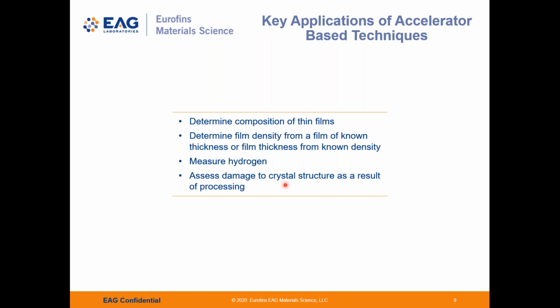Finally, being an ion beam technique, RBS can be used to evaluate crystalline damage in thin films as a result of processing, as well as provide information on dopants, impurities, and defect densities. Analytical problems have many facets, and sometimes choosing the right path to analysis can be challenging and difficult. Due to the multiple information paths available to us, RBS may help define a problem and an analytical strategy. It is a good choice for an initial analysis of thin films for both comparison or reference measurements. A first stop with RBS may save time or money in the long run.